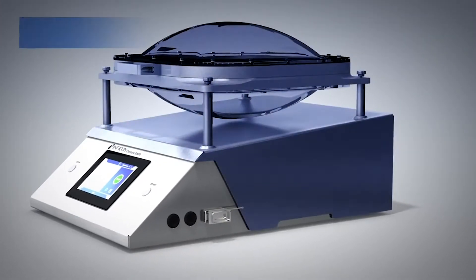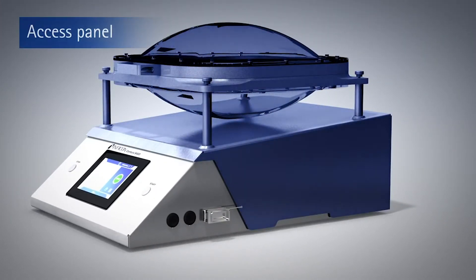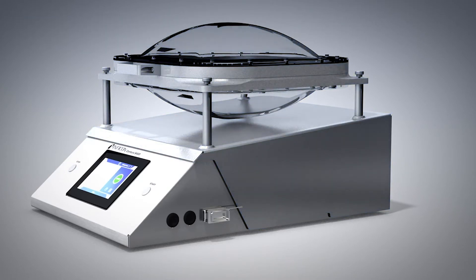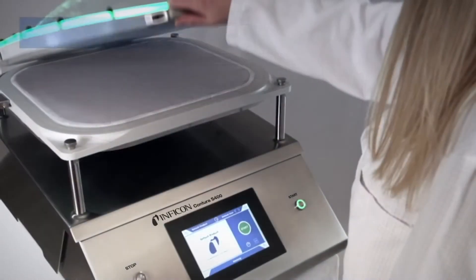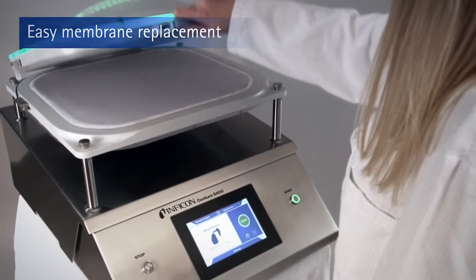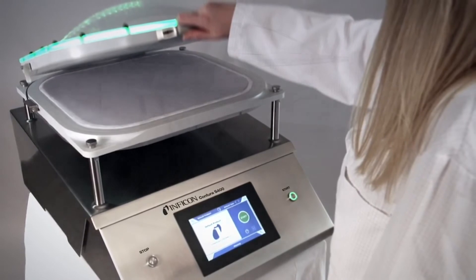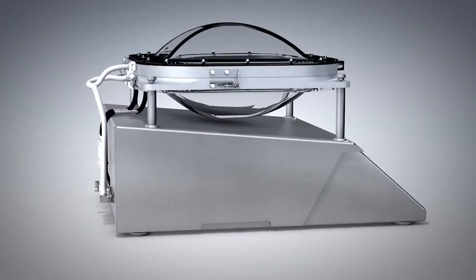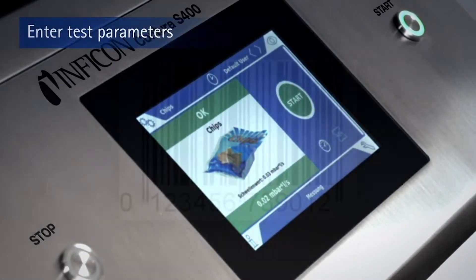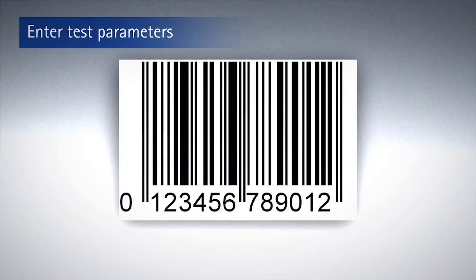The easy-to-use access panel permits simple hygienic cleaning and the quick replacement of consumables. If the membranes ever get damaged, they can be easily replaced by the operator in just a few simple steps. This saves service costs and the device is quickly ready for use once again. All important parameters for the measurements and the product can be entered using the touchscreen or optionally with a barcode reader.